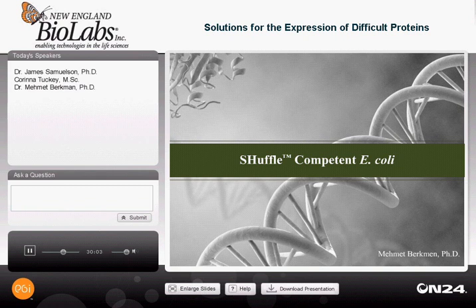Hello, everyone. My name is Mehmet Berkman, and I'd like to continue our discussions on solutions to proteins that are difficult to fold by introducing you to a novel E. coli strain engineered here at NEB, designed to express proteins that require disulfide bonds for their folding.